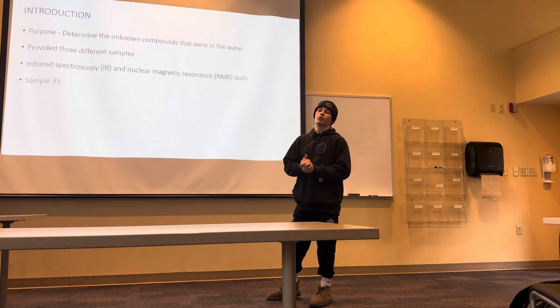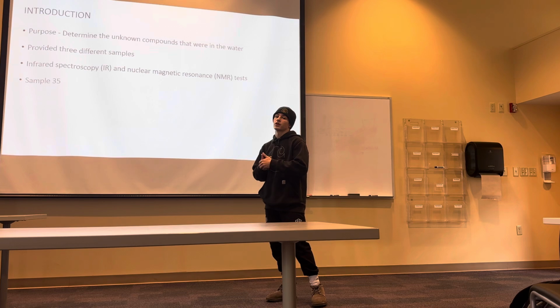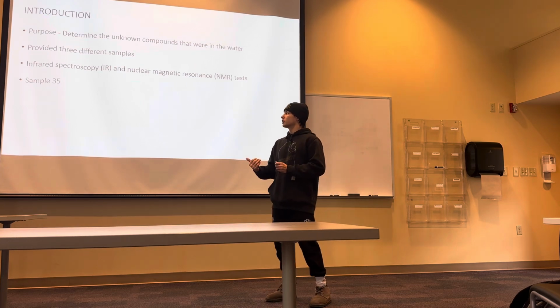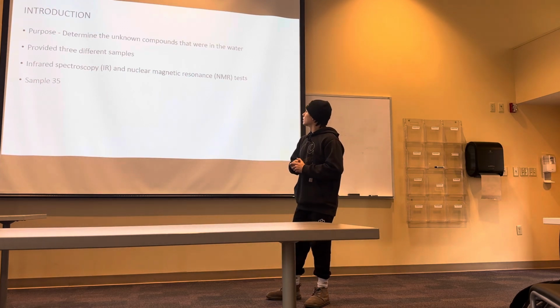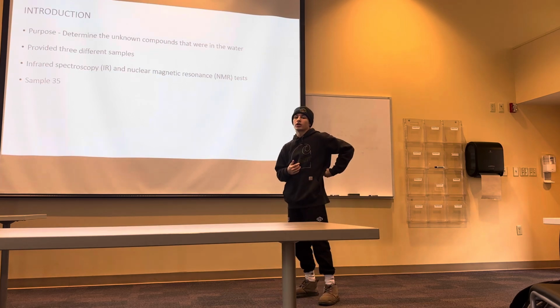Now, introduction. The purpose of this experiment was to determine the unknown compounds that were in the samples that were provided to us by Dr. Dwyer. Now, we use infrared spectroscopy, IR, and nuclear magnetic resonance, which is NMR, to test this chemical to figure out what chemicals are in this compound.